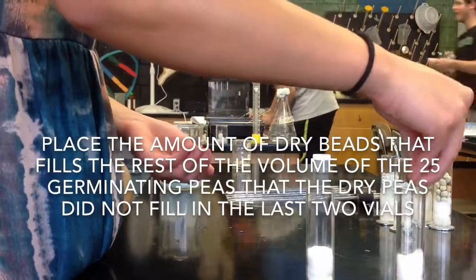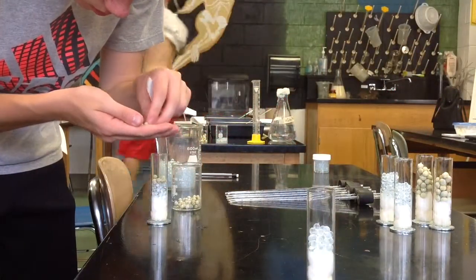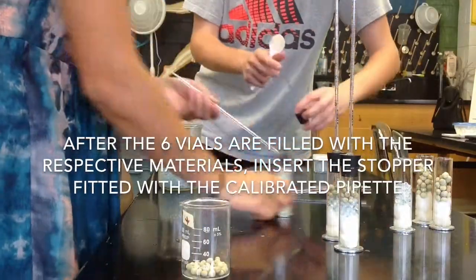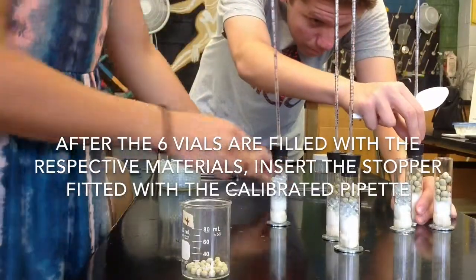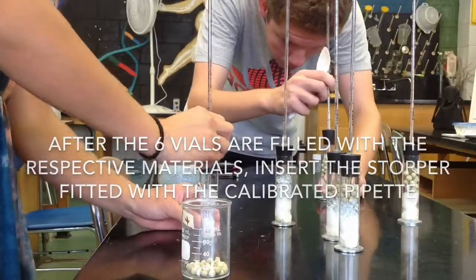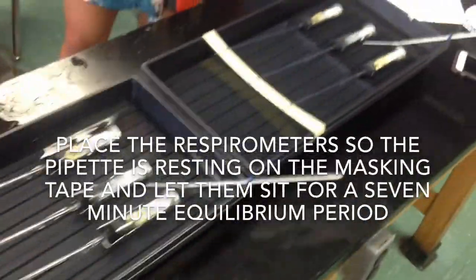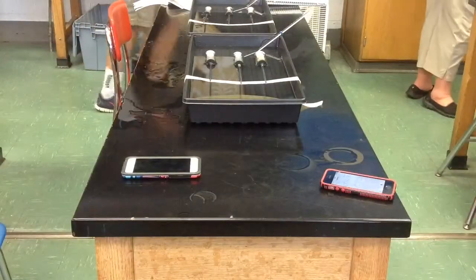14. Place the amount of dry beads that fills the rest of the volume of the 25 germinating peas that the dry peas did not fill in the last 2 vials. 15. After the 6 vials are filled with the respective materials, insert the stopper fitted with the calibrated pipette. 16. Place respirometers so the pipette is resting on the masking tape and let them sit for a 7-minute equilibrium period.